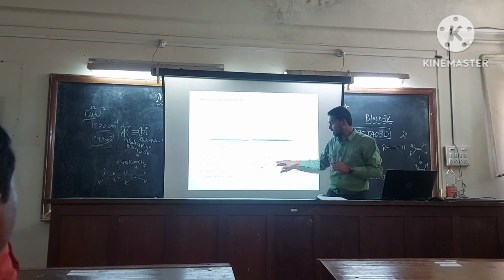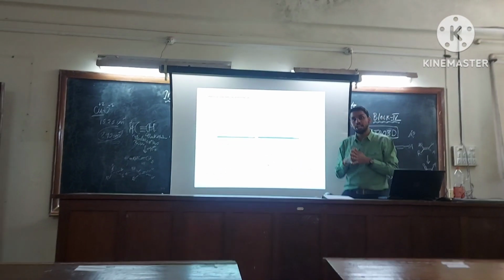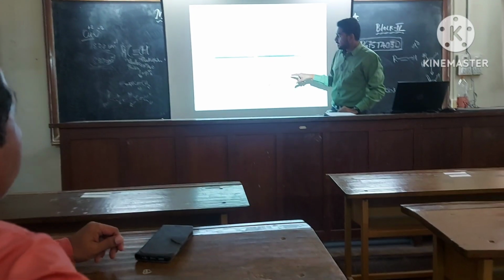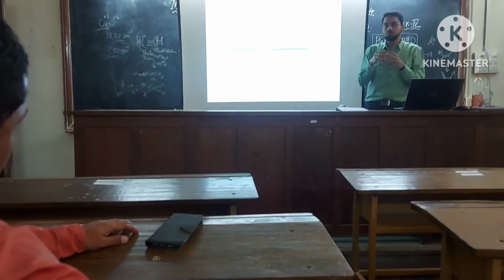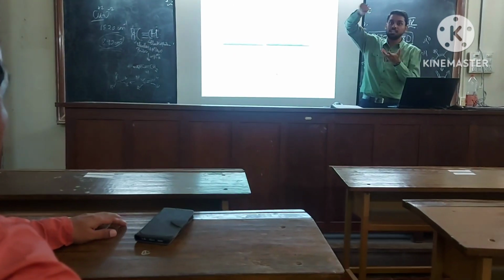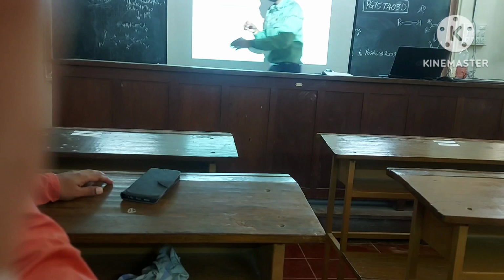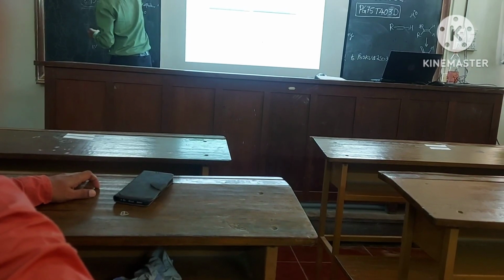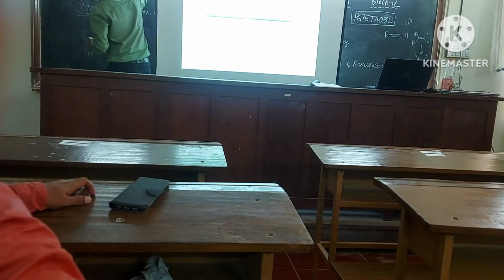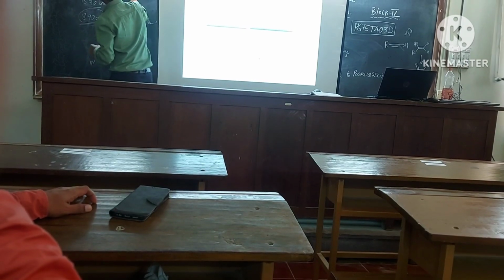For the average particle size we got 94.8. If it is coming below 100, that means we have got nanoparticles. It is not only the particle actually, but because we have used water as the dispersion medium, even the water molecules have added around the copper oxide particles. So if this is a copper 2 oxide particle, then we have water molecules added to it, like this. So this entire diameter is 94.8.